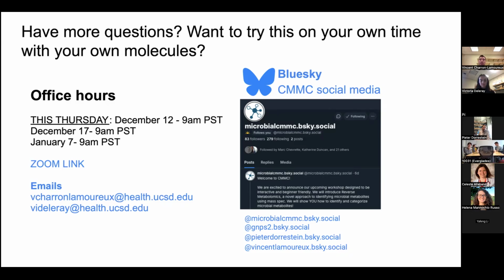Conceptually, they're essentially the same thing. In fact, what we do, even in micromasst, we search all the public data and then just filter for microbial data. The difference is, if you look at the metadata that's connected there, we search currently about 1 million LCMS files that are across the 3 repositories. About 700,000 of those have some sort of metadata. So a lot of public data doesn't really have metadata.